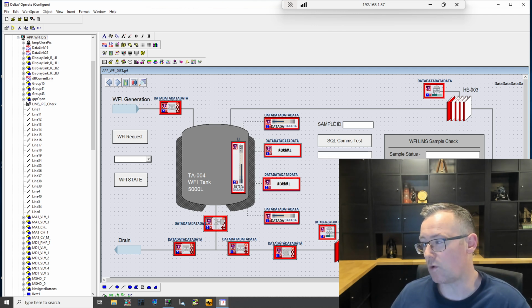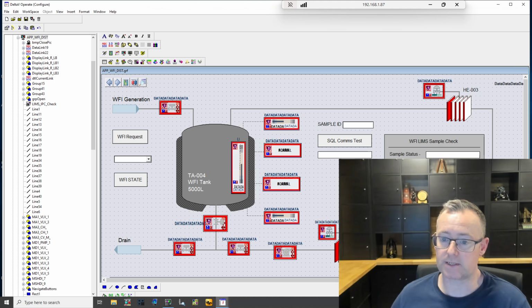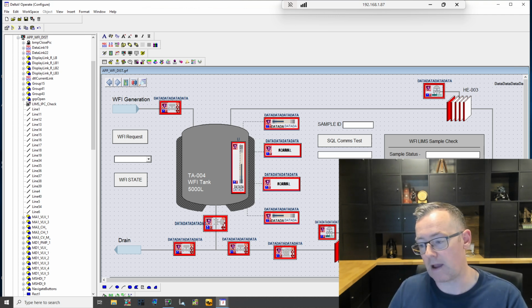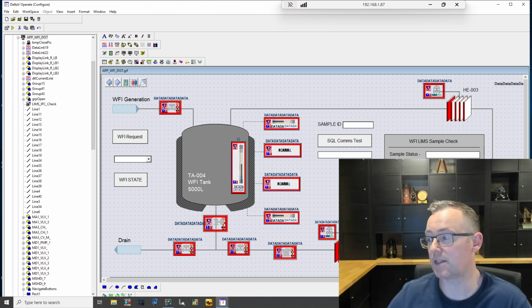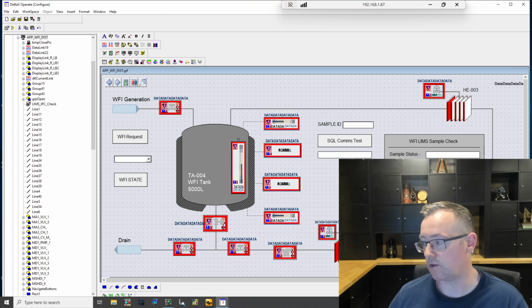The way around it, if you want to run queries that happen in an automatic way and you don't have some kind of middleware MES system, is basically to monitor an actual tag, like an OPC tag, and then take actions based upon that. But this is certainly still very useful as a quick way to add additional checks into your process as per procedure. And you can put audit trail links and so on behind these kinds of buttons, which is very good to have.